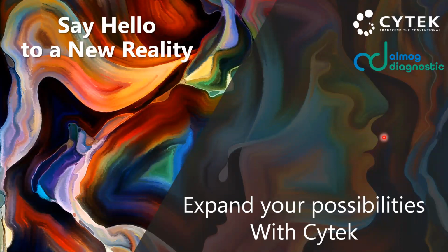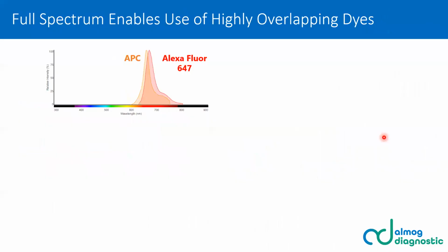So now that we have talked about fluorochromes, their unique signatures, and unmixing, let's talk about the wide range of possibilities using Cytek instruments. So full spectrum analysis enables us to use highly overlapping dyes. This is something that San has already mentioned in her session, but now I would like to walk you through this superpower of spectral flow cytometry.